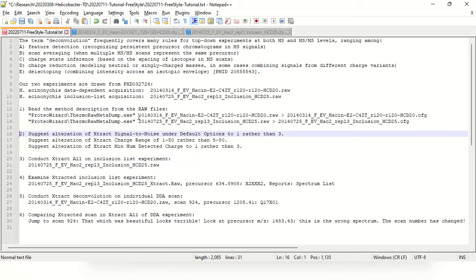And I'm going to note that some of the default options seemed a little problematic for some of the data files I used it with. So I'm going to suggest 3 different things that we want to change within Xtract to possibly improve its performance in my data set. It is possible that you will have a different set of preferences for how to do it, so you should not treat these as canonical. These are just my opinion.